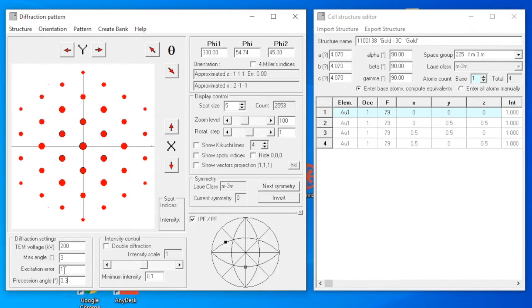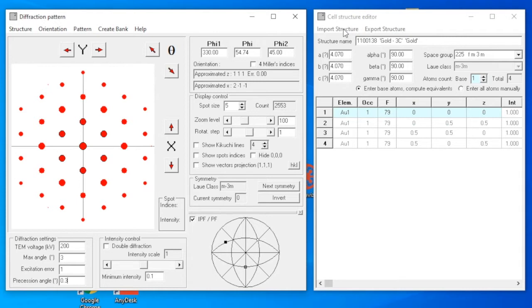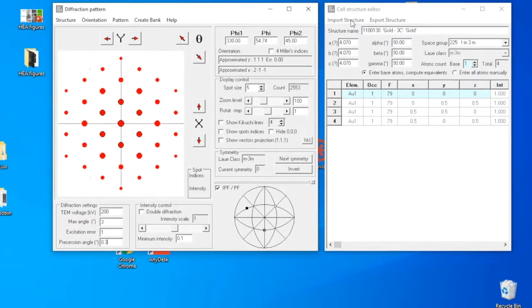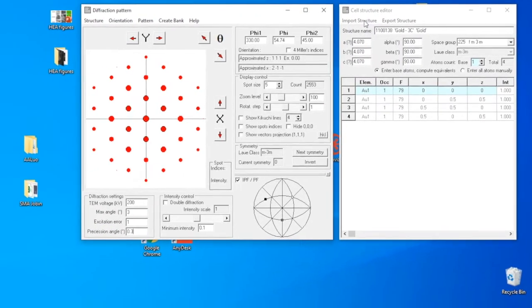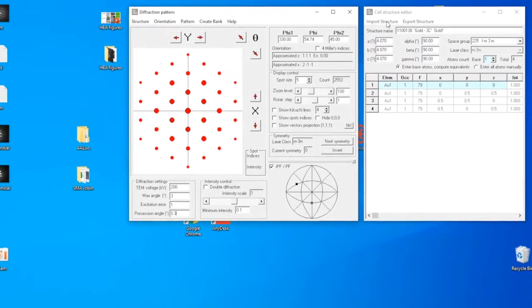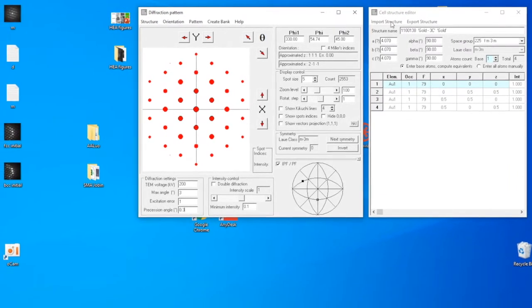The precession angle we used in our experiment was 0.3 degrees, so we input 0.3. For the rest of the parameters, we leave everything as they are. However, I strongly encourage you to explore what you can play with these parameters and what these parameters mean. Now we are ready to create the bank file. We need bank file to do orientation reconstruction.